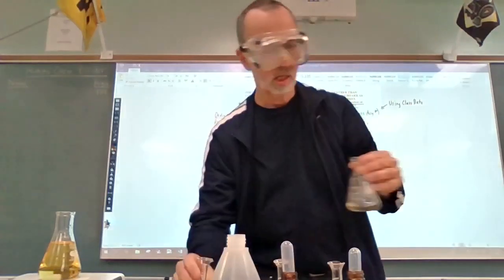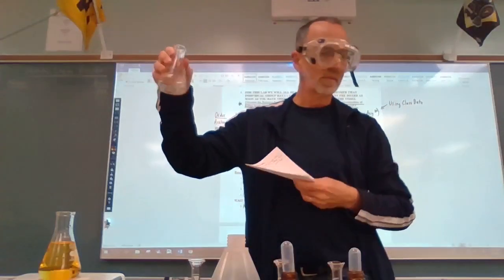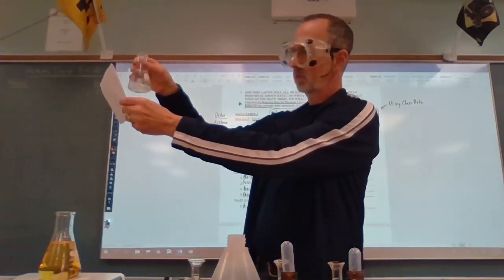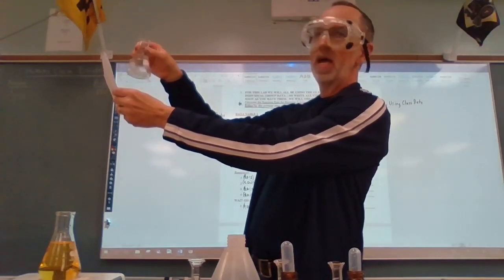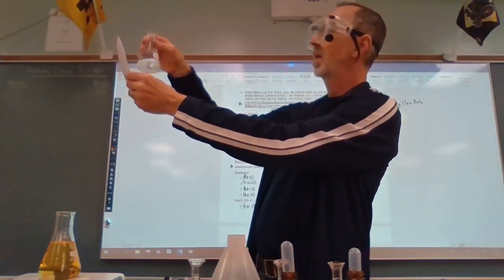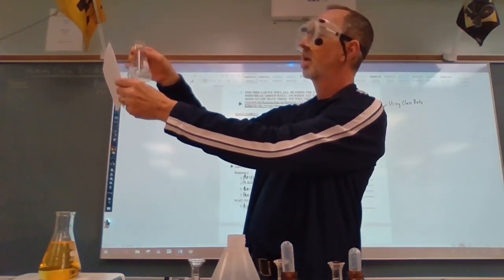And there we go. Again, it's a very light yellowish brownish color, very, very faint. And again, it's starting to fade pretty quickly here.